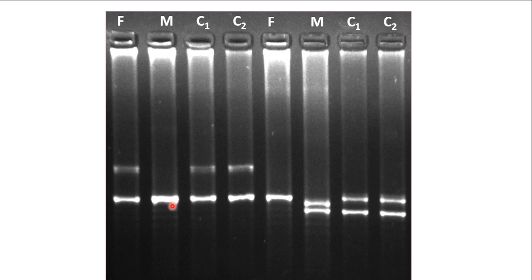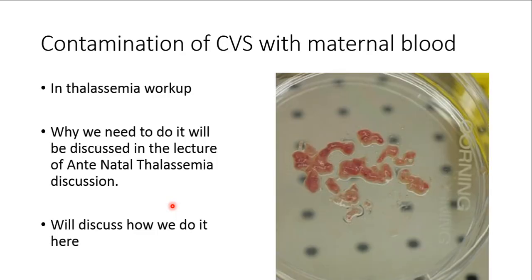Now regarding contamination of chorionic villi samples with maternal blood: this is usually done during thalassemia workup or any prenatal workup for genetic disorders. The chorionic villi are collected from the mother, and there are chances that during this process some maternal blood may be present. If adequate care is not taken to separate maternal blood from the chorionic villi, the DNA present in the WBCs of the maternal blood would also get extracted, giving confounding and difficult-to-interpret results.